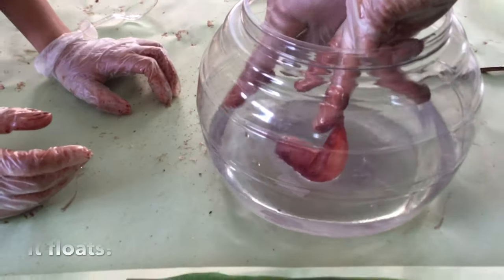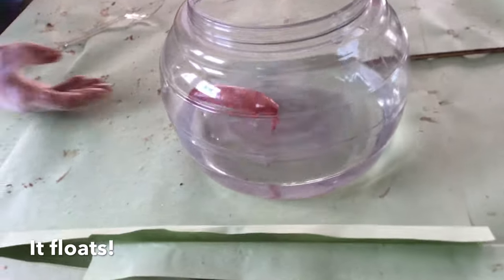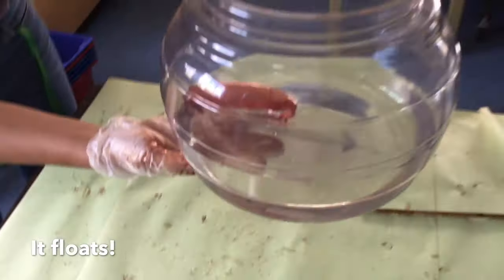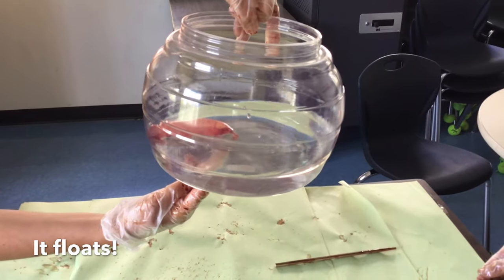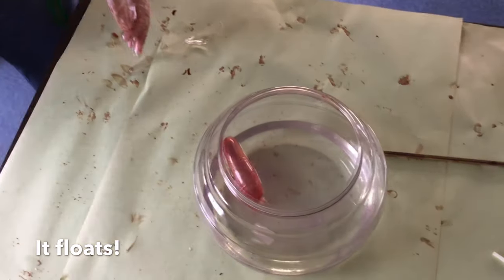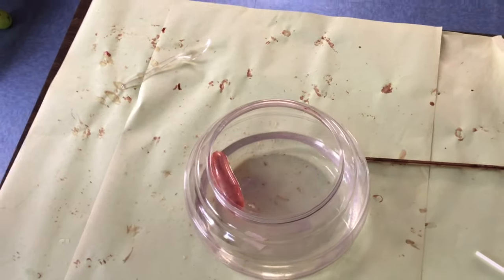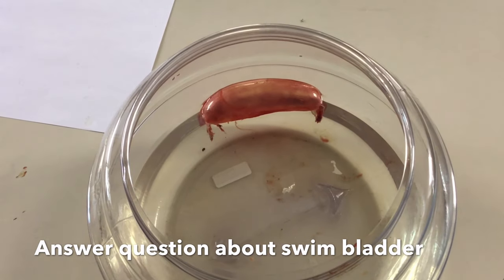Is perfect. Oh, here it is. Floats along the surface of the water, all nice and buoyant. And that was a perfect removal. I don't have to blow it up with straws or anything. Wow. Answer the question about the swim bladder in your booklet.